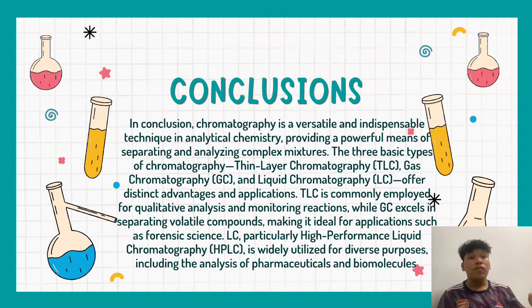We have arrived at the last chapter, which is the conclusion. In conclusion, chromatography is a versatile and indispensable technique in analytical chemistry, providing a powerful means of separating and analyzing complex mixtures. The three basic types of chromatography, the first one is thin layer chromatography, TLC, the second one gas chromatography, GC, and the last one is liquid chromatography, offer distinct advantages and applications.